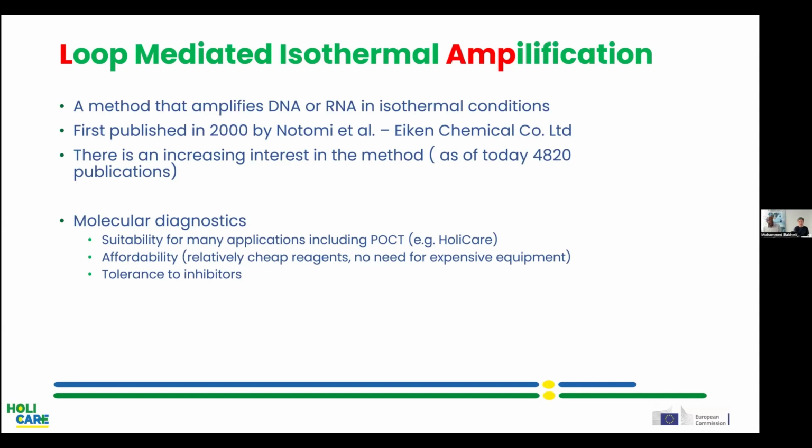It's another advantage that it's very affordable, with relatively cheap reagents. The polymerase itself is also not that expensive. And most importantly, there is no need for expensive equipment to perform the LAMP. So it's more suitable for resource-poor settings and outside developed laboratories.